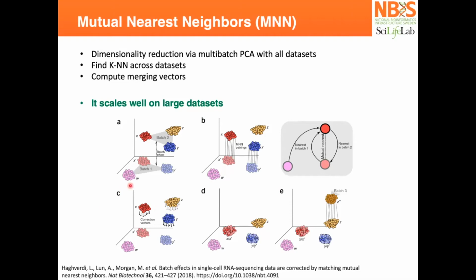Yes, exactly. So imagine that you have this batch 1 with the purple, red, and blue, and then you try to integrate with batch 3. That will not cause an error, you will get an integration, but maybe the cells from batch 3 will be present in all those 3 here, because there is no respective yellow cluster here, right? So you will try to find the integration, but the integration will not be correct.